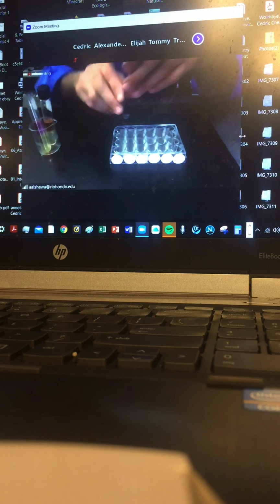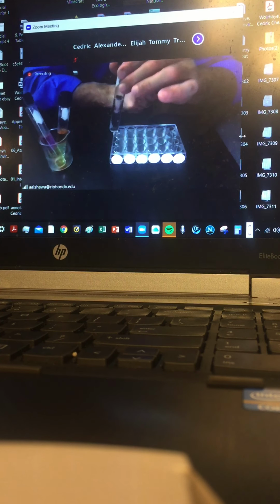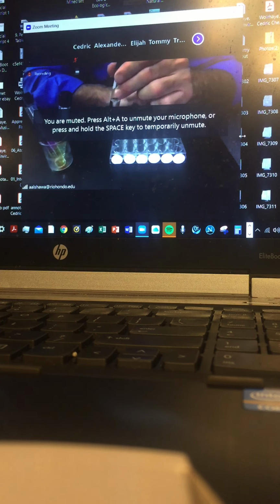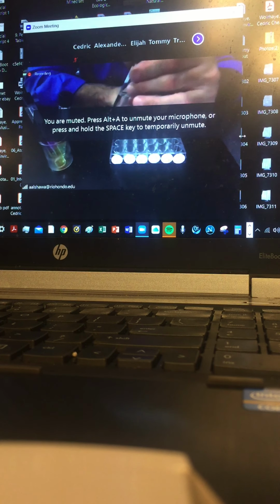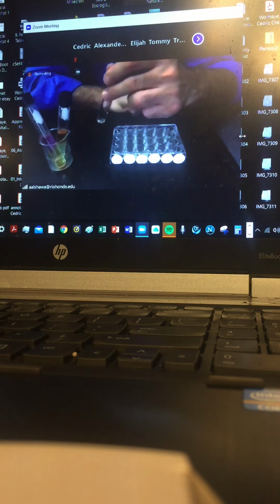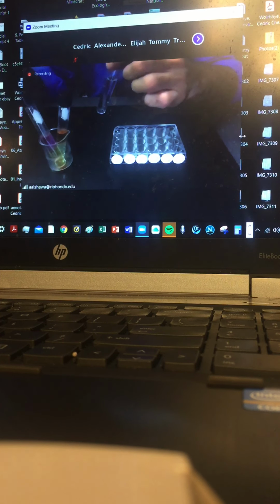The minute you uncap that bottle, it will escape automatically, because chlorine at room temperature tends to be a gas and would not remain in the water. So once you open that bottle and try to scoop a small amount, a good chunk of that chlorine found in the water is going to try to escape. So at the beginning of the class, if your friends are not careful and keep that bottle of chlorine water open, what's going to happen? At the end of the class, there's nothing left of that chlorine, only water, and just a clear solution like this.